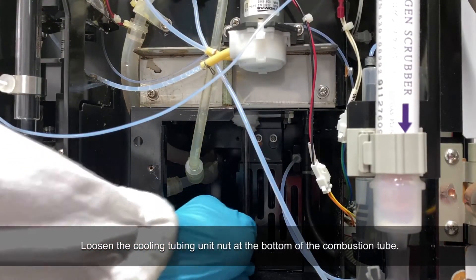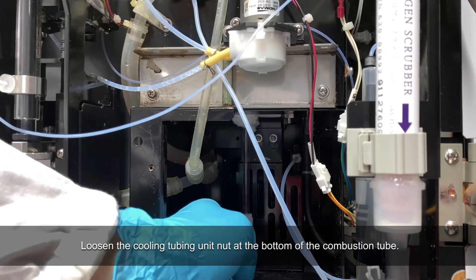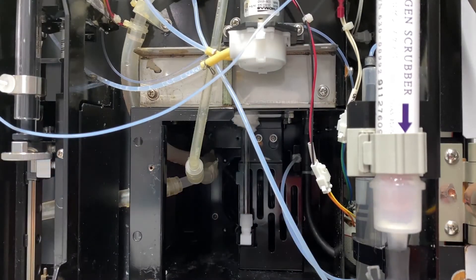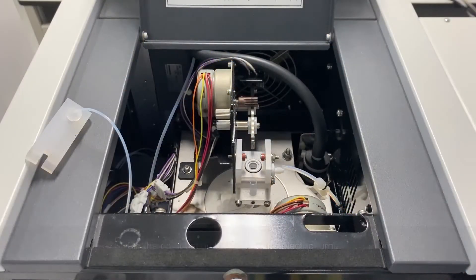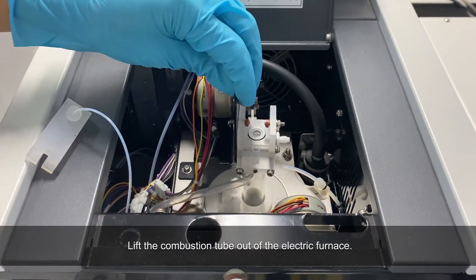At the bottom part of the combustion tube, loosen the cooling coil retaining nut. Now, carefully lift the combustion tube out of the electric furnace.